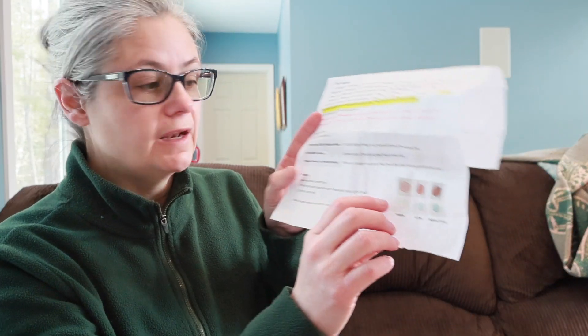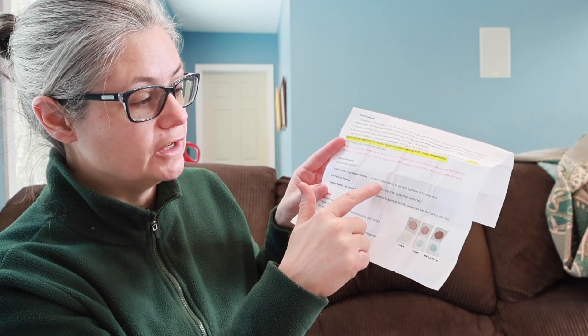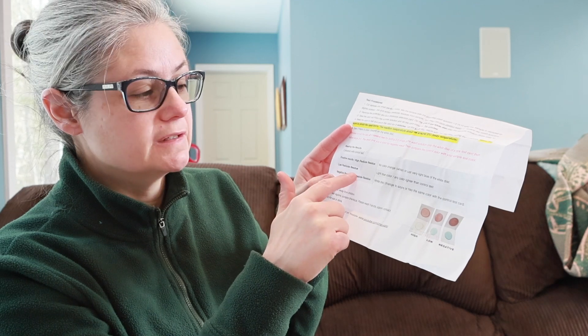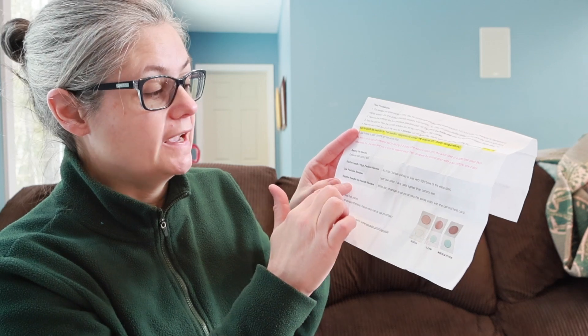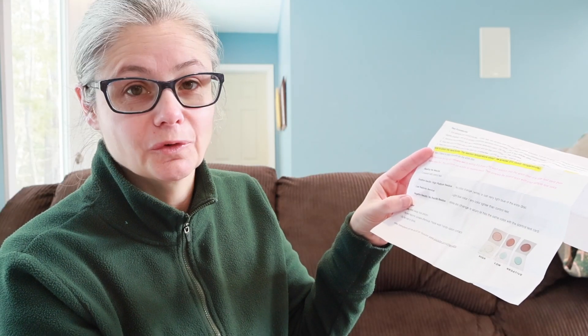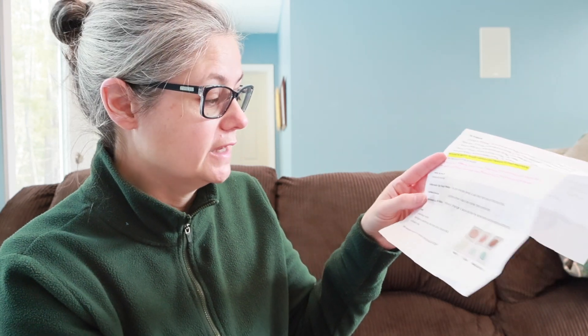Looking at the results guide: a positive, high pesticide residue result would be no color change — white or very light blue. Low pesticide residue would be a light blue color, lighter than the control test. A negative result — no pesticide — is when the white disc changes to azure blue or has the same color as the control card.